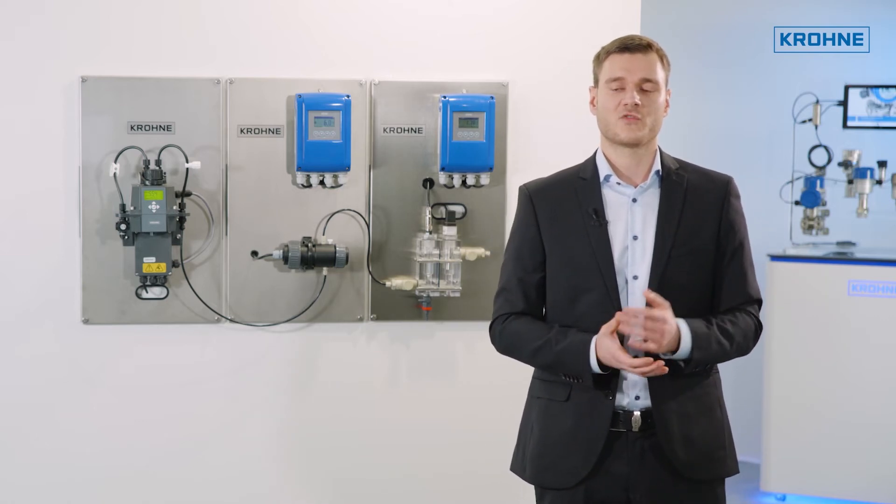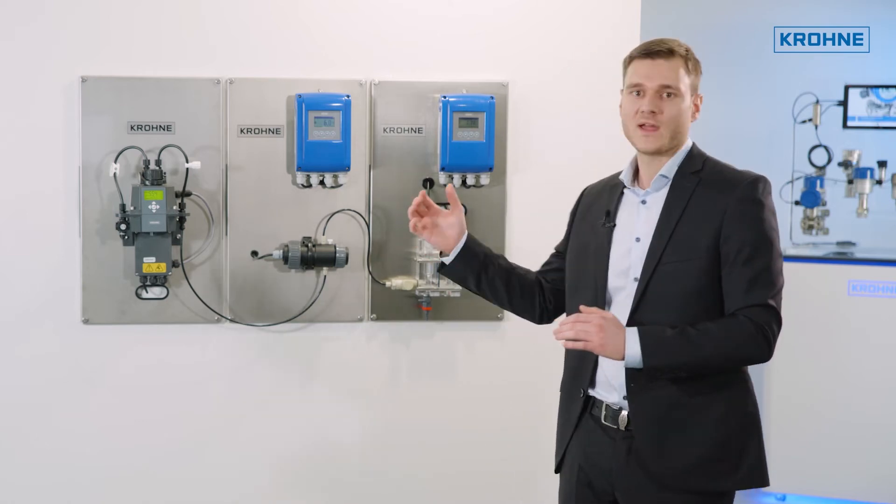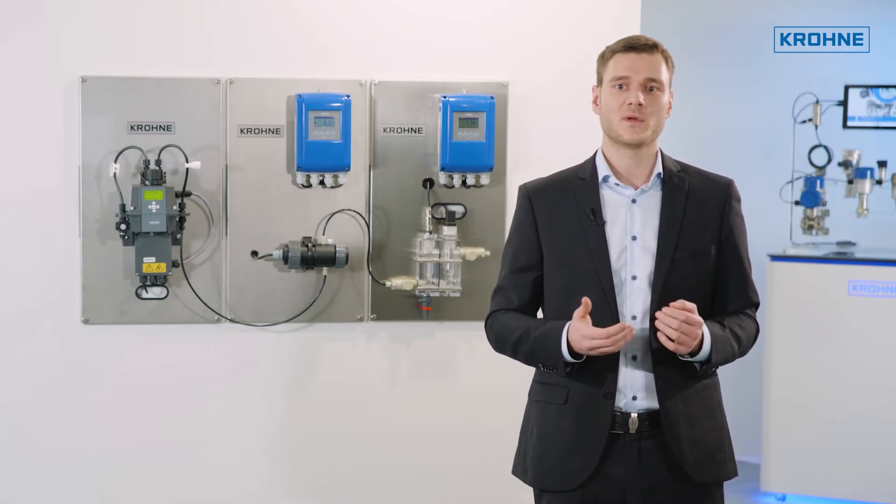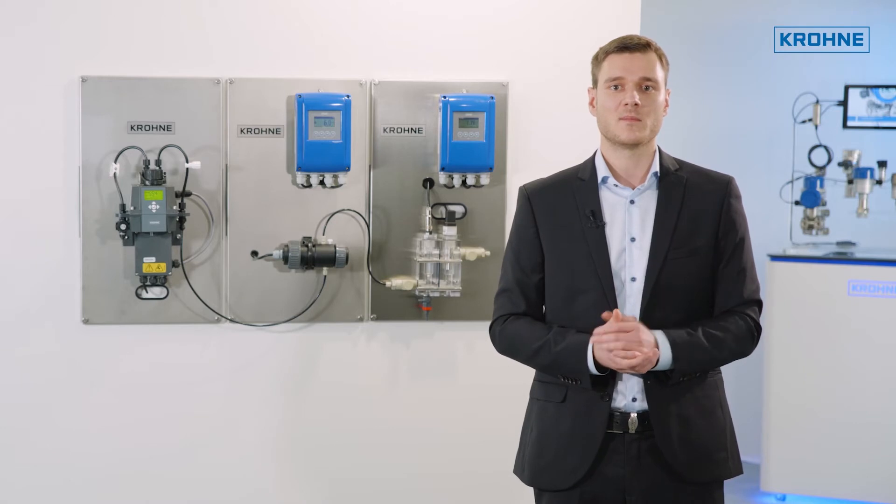Following customers' suggestions, three new modules have now been added, with which important parameters such as turbidity and pH value can be measured.